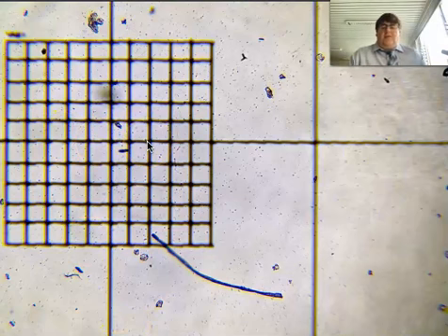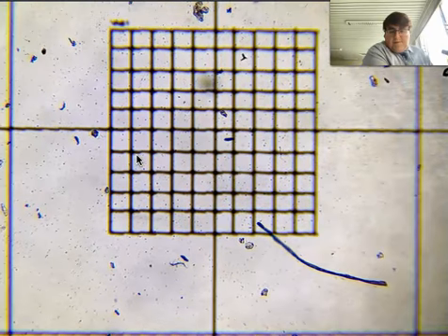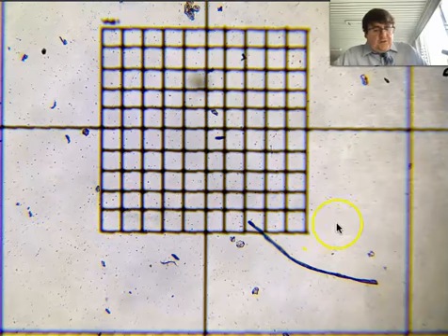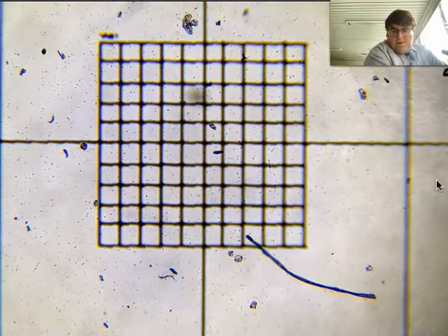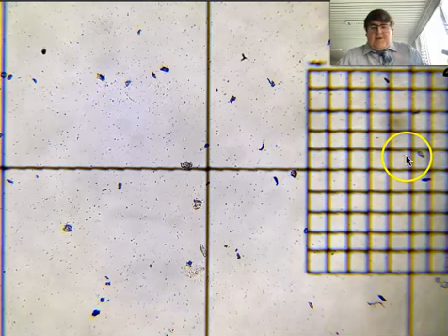So that tells me if I'm looking across this entire length, I'll just move the microscope over a little bit so we can see some whole squares, start in the whole square. So roughly, I can definitely fit 2 whole squares across the slide here, and there's a little bit more. The best way of doing that, I suppose, is to try and get it so we know it fits 2 whole squares in. There we go. So we've got our 2 whole squares, so we know up to here is 2 millimeters, and then there's another 2 small, which is 0.1s.